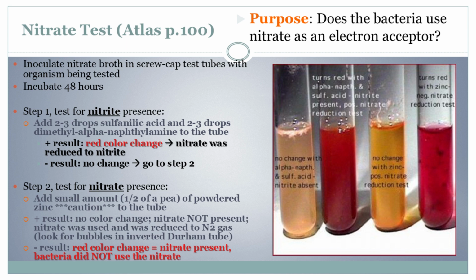That's where our backup detective comes in. Zinc powder. Does it change colors too? Zinc itself, no. But it can force a change, revealing the truth. Okay, I'm intrigued. Tell me more. So we add the zinc. If the broth still doesn't turn red after that, still no red. What does that tell us? It means our bacteria are overachievers. They haven't just reduced the nitrate, they've gone a step further and broken it down completely to nitrogen gas. Wow, so they're like master criminals covering their tracks.